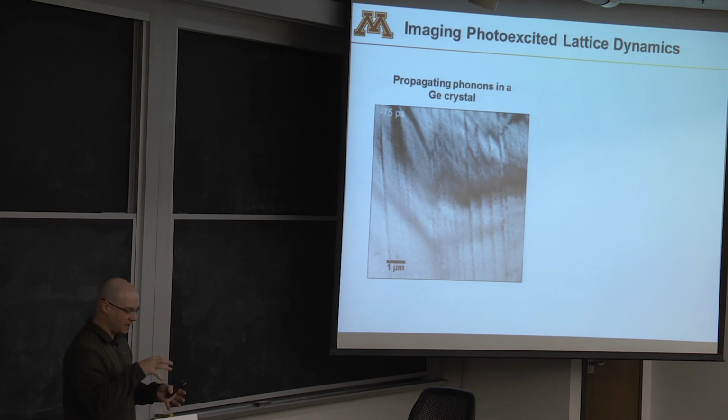So it turns out if you shine laser light on a semiconductor, there is a huge number of things that happen. I mean huge. And they span a huge range of time. First thing, what do you think happens? The electrons are excited, right? That's what light does. It interacts with the electrons in the material initially, right? They're going to scatter off all kinds of stuff. Pretty soon you get what are called phonons excited in the material. These are oscillations of the lattice. It starts moving around because of all these scattering processes.